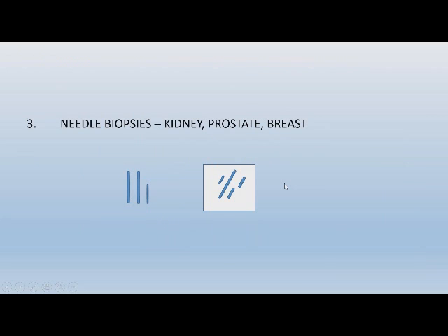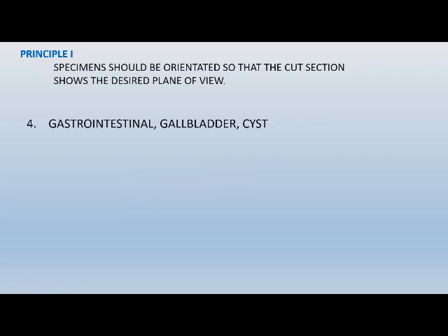So as we go on to needle biopsies, there's not a terrific amount to be said about these, but the same thing has happened to me with a needle biopsy that has been embedded something like this. I have peeled up one of these edges and lost part or all of one of the biopsies. That was probably because I was committing an error in microtomy, but yet it still happened. If it had been embedded like this, it's going to cut through at a diagonal and be less likely to pull one of those biopsies out of its little casing there.